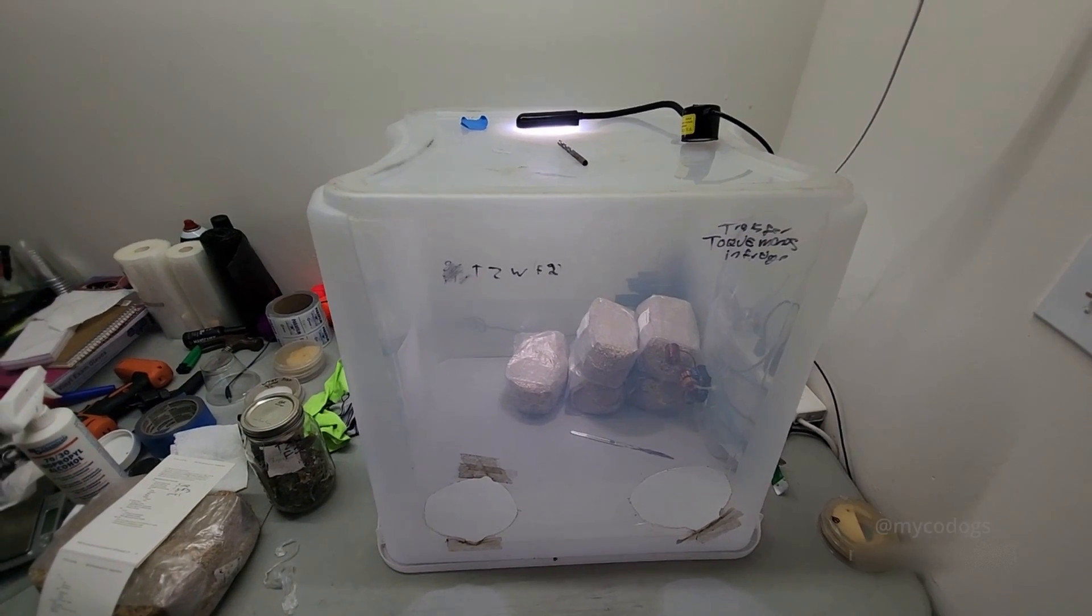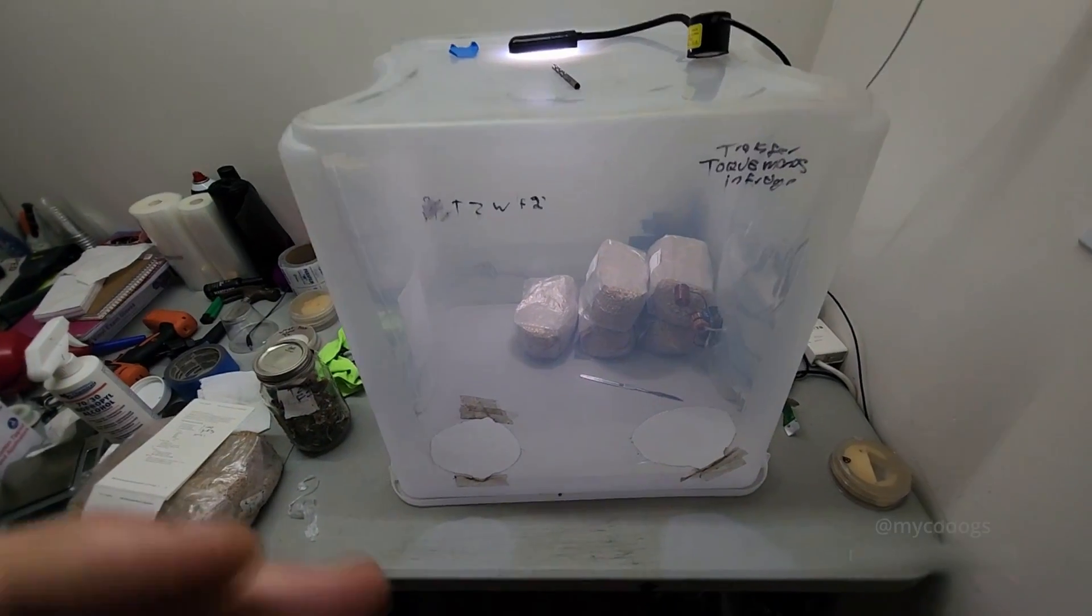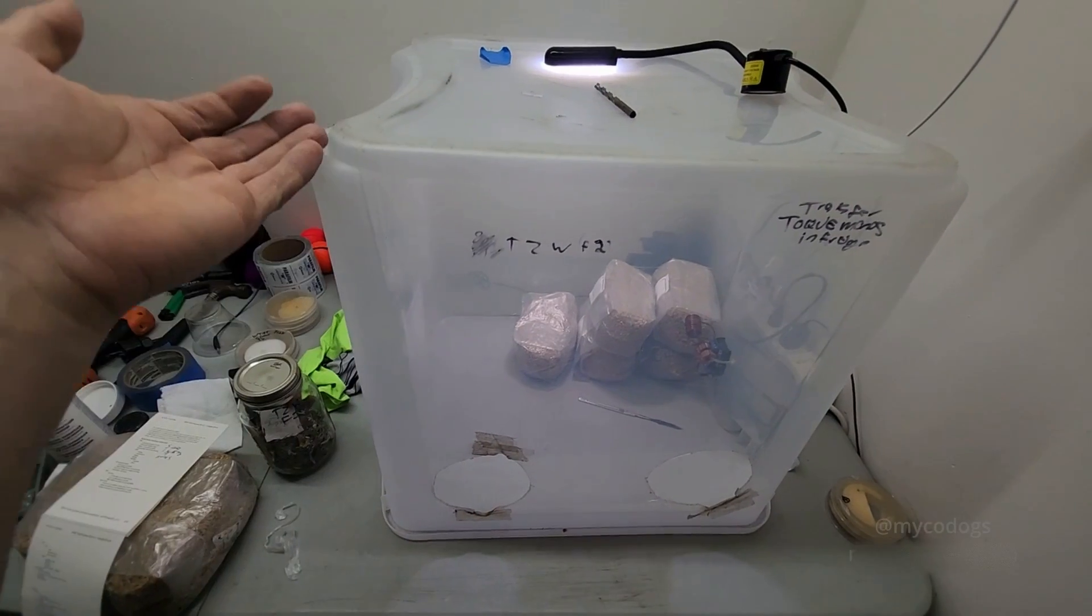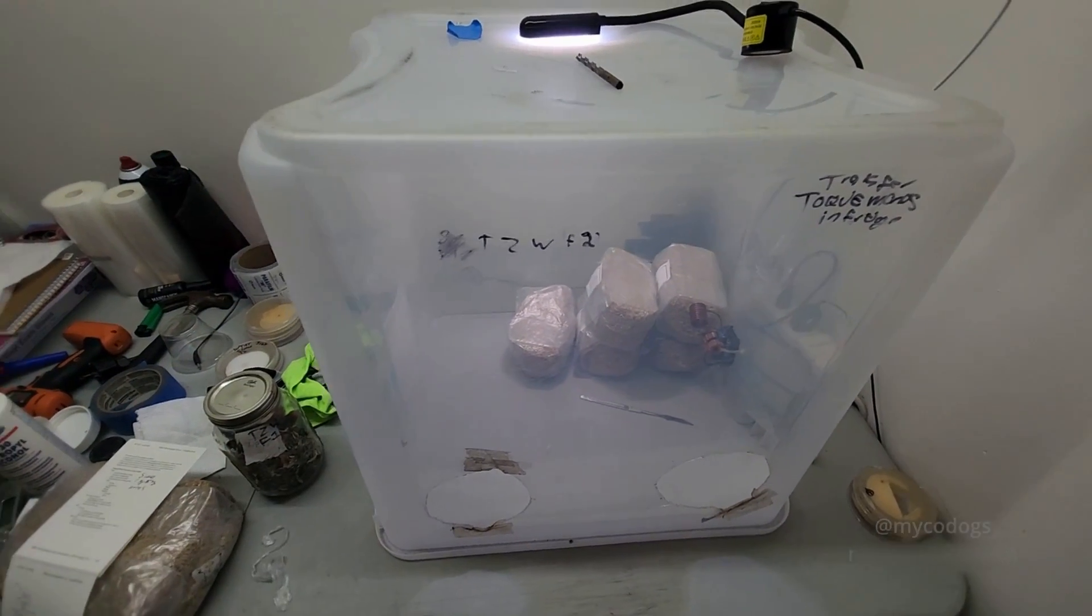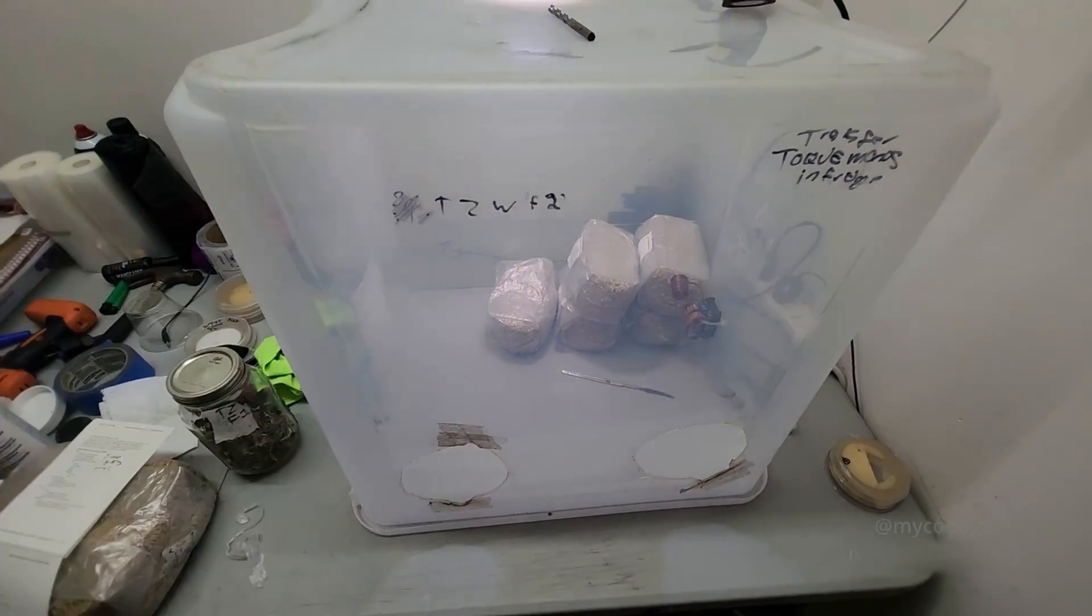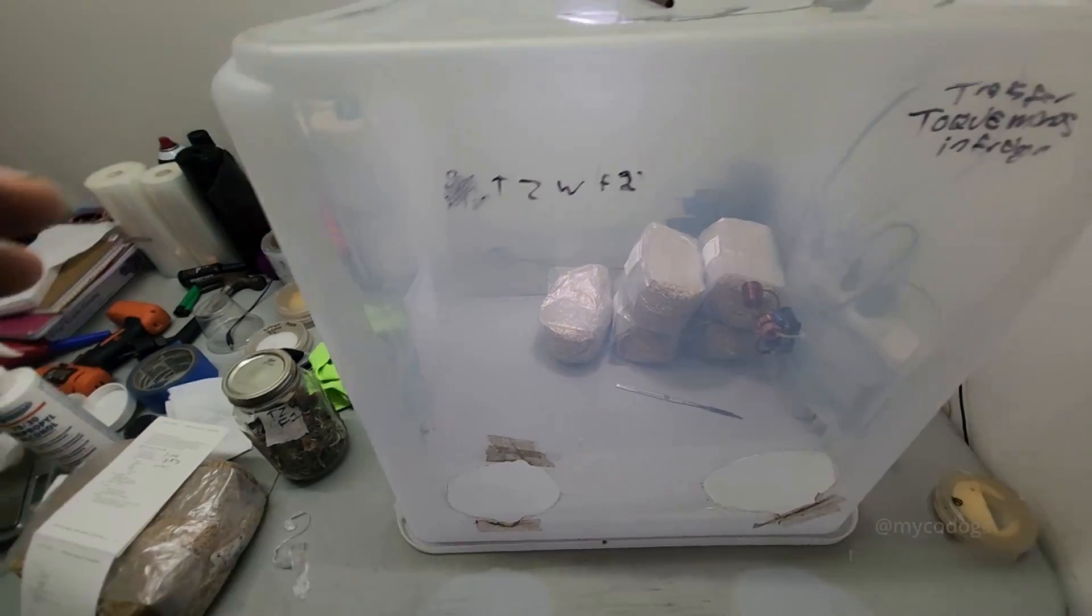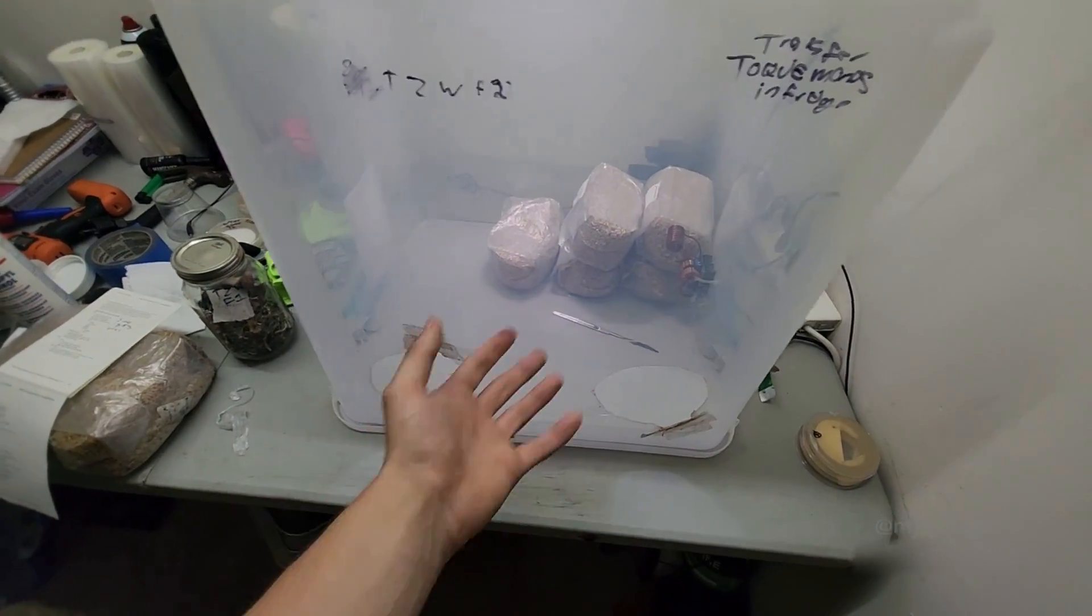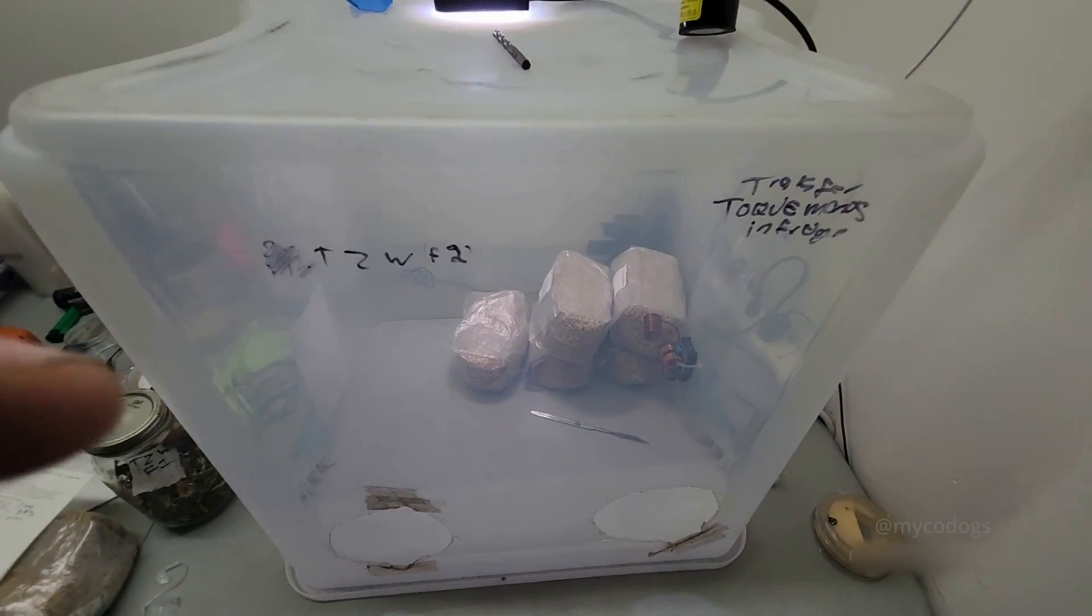All right, before we jump in, I just want to talk about what kind of still air box should you get. In my opinion, I think it's better to get a taller still air box than it is to get a wider still air box. That's primarily if you're working with bags or pouring plates inside of it. You want a nice vertical that gives you a lot of workspace. You don't need a whole ton of horizontal workspace because you can take things in and out of it as you're working, but the vertical really helps.